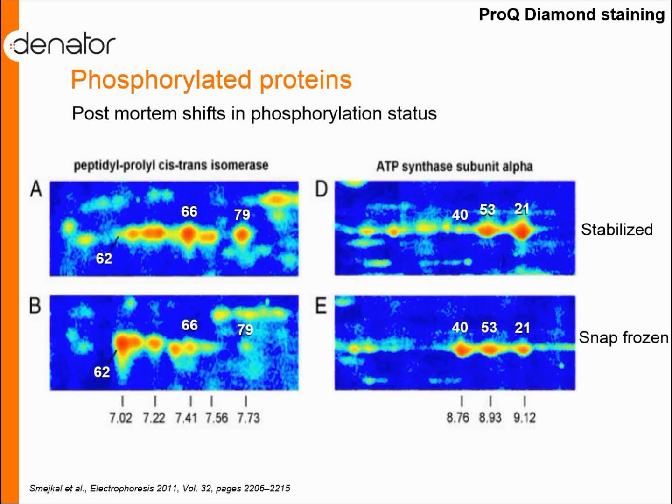This is a dilemma with doing just direct comparison. They look very different, but it's of course not possible to say this is correct and this is not correct. But it begs further investigation into what is the most in vivo-like representation of the isoforms of these two proteins.